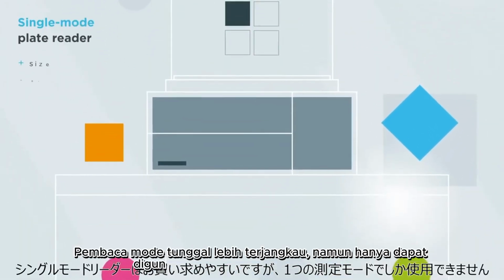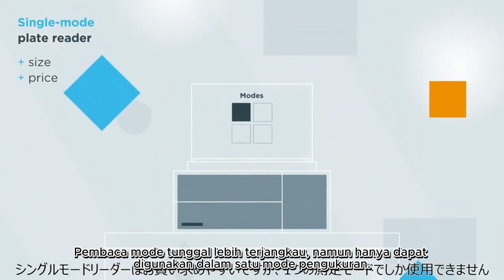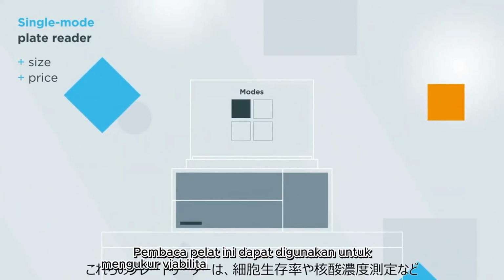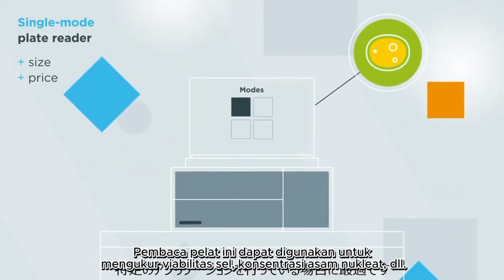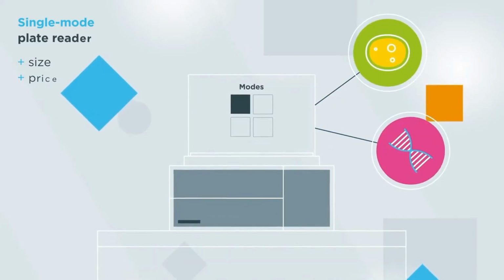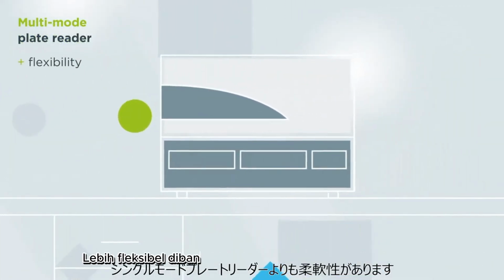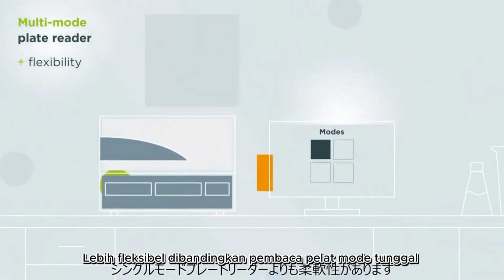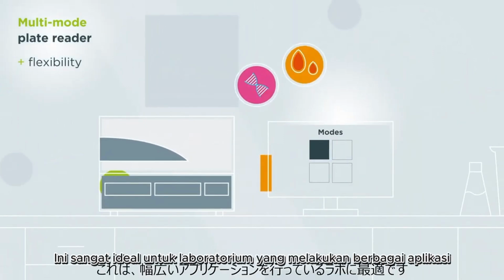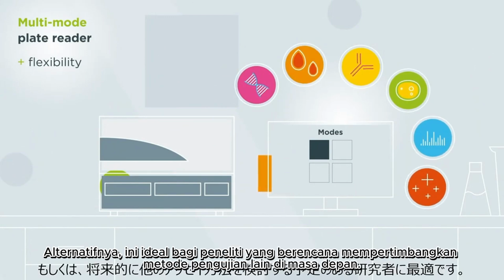Single-mode readers are small and economical, but they operate in one dedicated detection mode only. They are a perfect choice for narrow applications, such as measuring cell viability or DNA concentration. Multi-mode readers provide much more flexibility, as they operate in a few detection modes. They are ideal for labs with a wider range of applications, or those which are planning to expand their applications in the future.